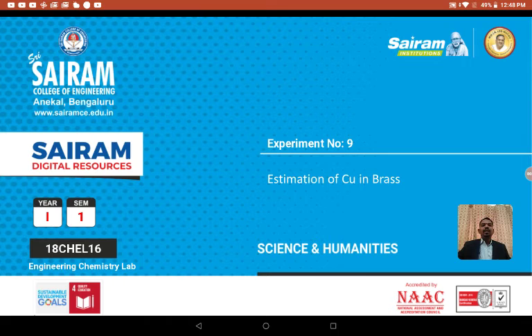Today we are going to estimate the percentage of copper present in the given brass sample. What is brass? Brass is an alloy. What is an alloy? A combination of two or more metals or non-metals gives you an alloy. So brass is an alloy of zinc and iron. I mean copper and zinc, right? Copper and zinc. In that, we're going to estimate how much percentage of copper is present. Let us see how it is done.